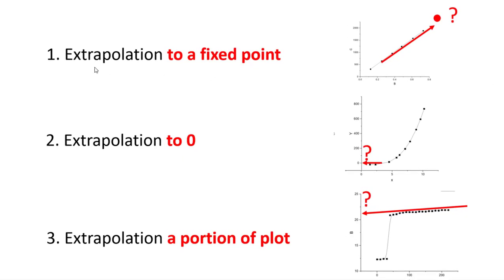In this short video we look at extrapolation using Origin. There are three examples: first, where we have a linear plot and want to extend it to find an XY value at a particular point; second, a variation moving backwards where a curve plot is extrapolated back to where it passes the y-axis at x equals zero; and third, extrapolating a portion of a plot back to the x equals zero point.